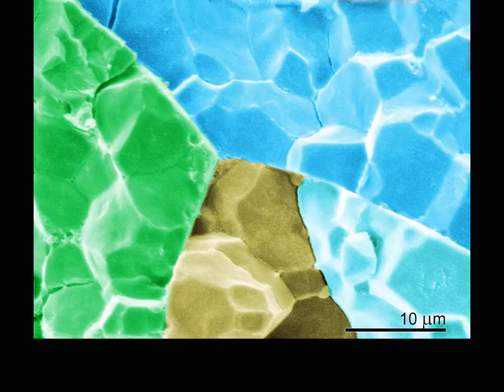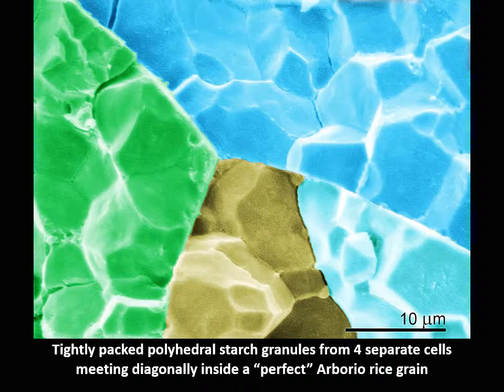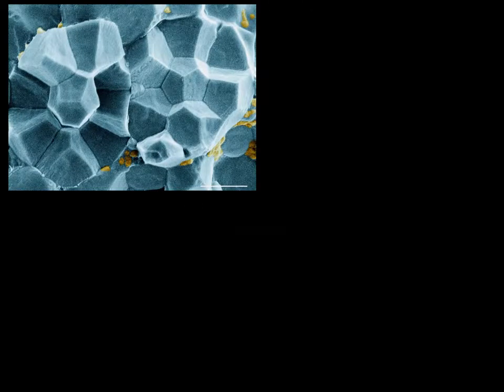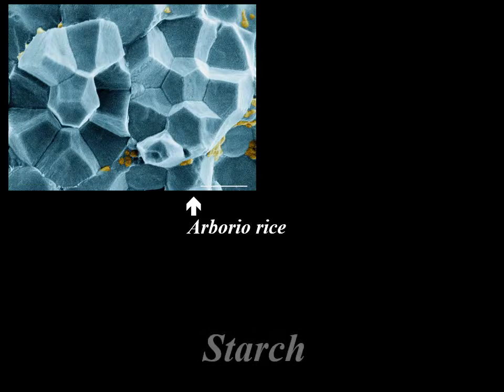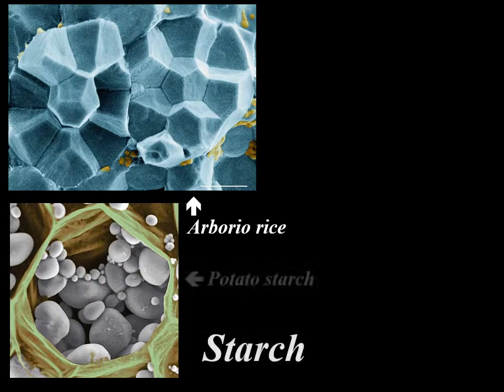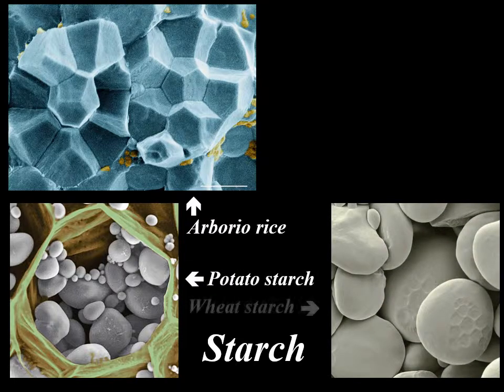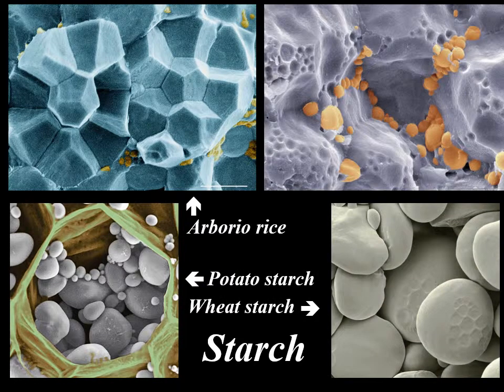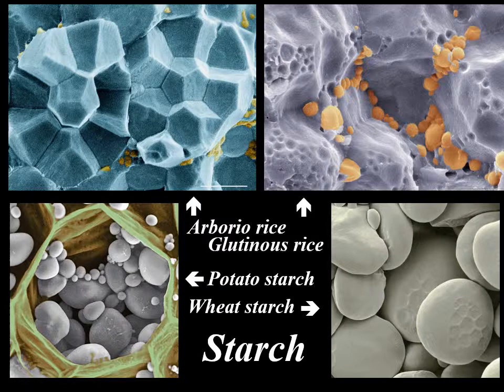In the next micrograph at a higher magnification, four grain cells with polyhedral starch particles meet diagonally inside a perfect Arborio rice grain. The starch in Arborio rice is particularly well organized in the form of polyhedrons, with mostly pentagonal and hexagonal walls, in contrast to oval starch granules in potatoes or wheat starch. Yet the rice starch particles accommodate minute protein bodies, as seen in a fractured glutinous rice grain. On fracturing, protein bodies which disengage from the starch particles leave dimples in their surfaces.